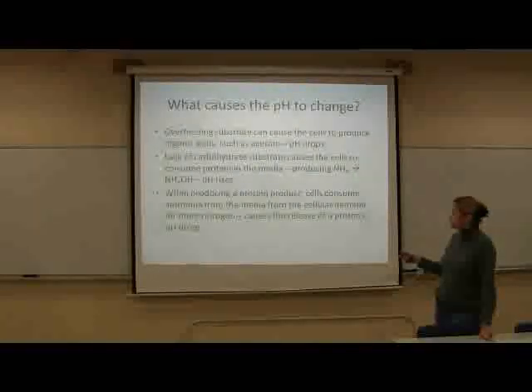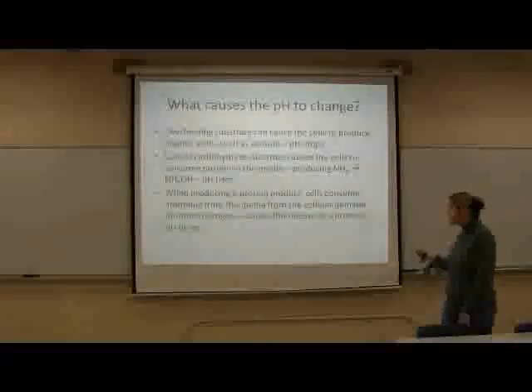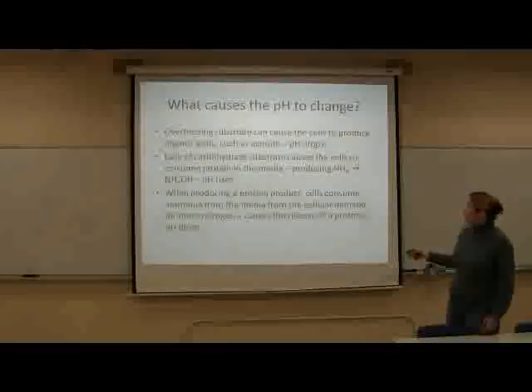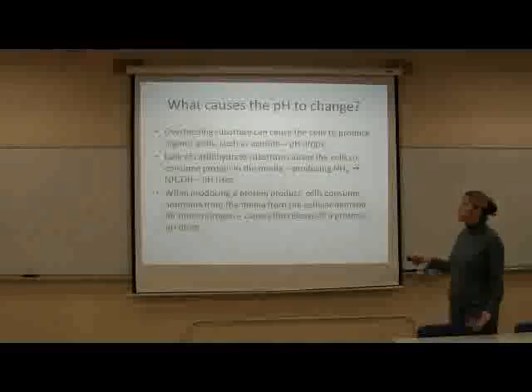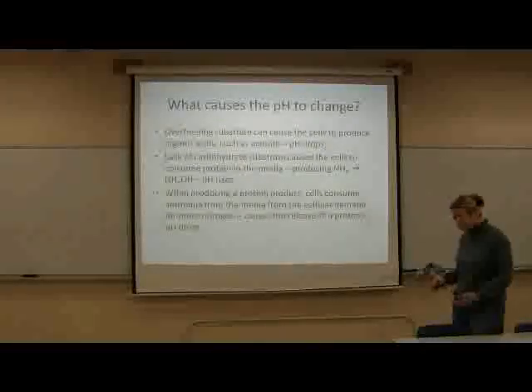So under those circumstances, what's the best thing to do? Any guess? Give it some food. That's right. It's just hungry. Feed it, and you'll be fine. All right. So I'll skip the next one because it's interesting, but it's not really. I mean, we are producing a protein, but we're really mostly producing cells, and our protein is inside the cells.